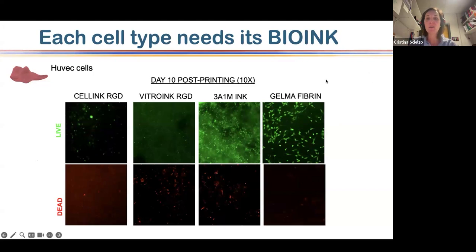But in the case of cells not of hematopoietic origin, you don't only have to consider that they are alive, you also have to consider the morphology. The lymphocyte is round, so easy, but in the case of endothelial cells or in general fibroblasts, you expect cells with an elongated morphology. So this is important, and this is your readout to see if it works or not.